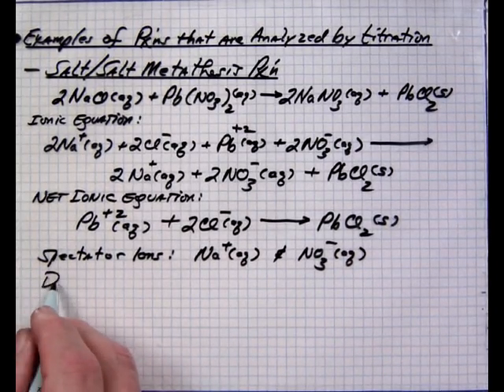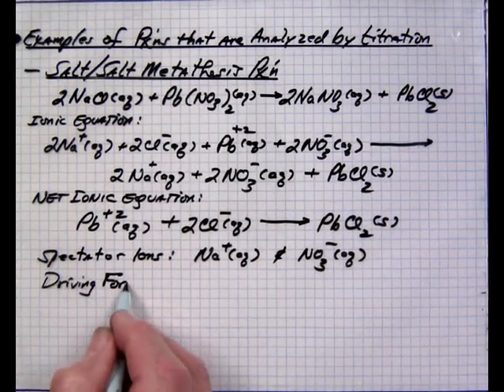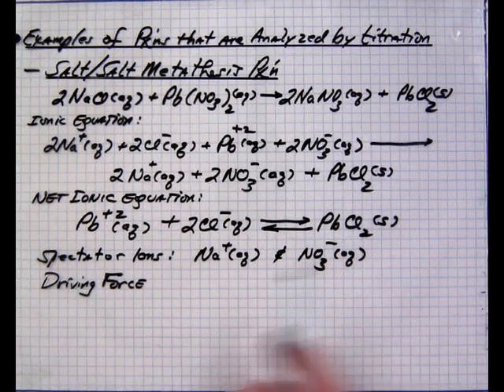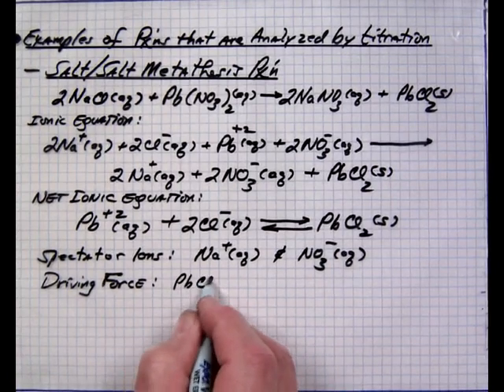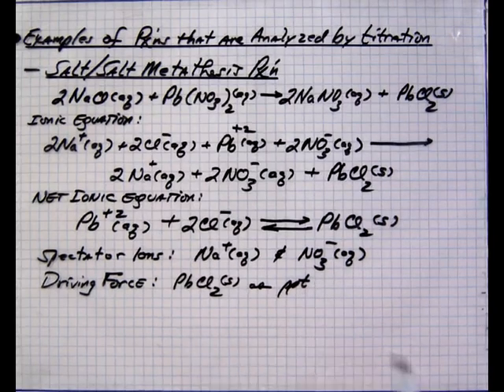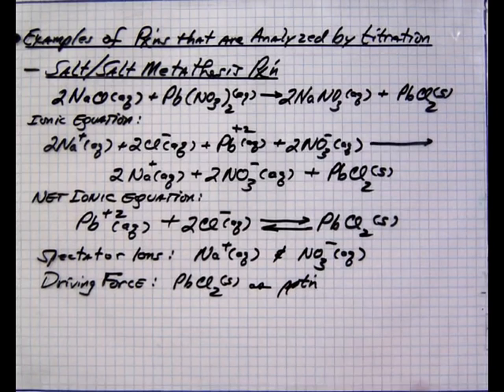The driving force of the reaction, which is typically shown as an equilibrium, is the precipitation of lead chloride.